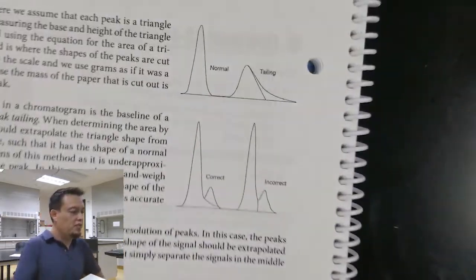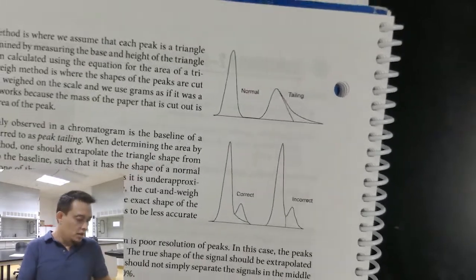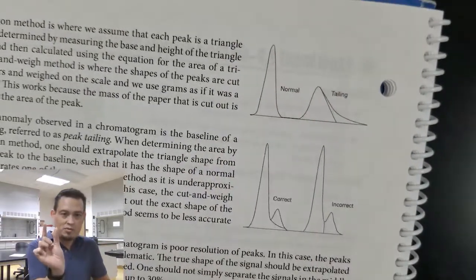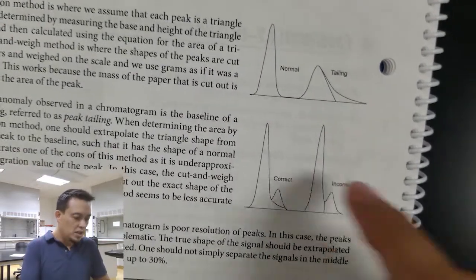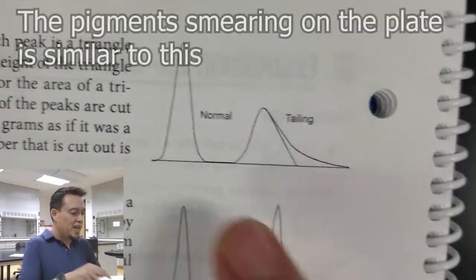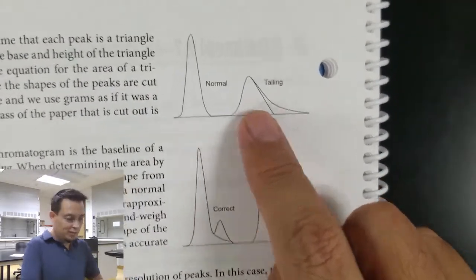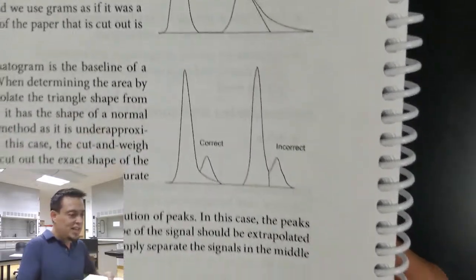Here also in the chart, I show you some examples of bad data versus good data. If you're getting good chromatographic separations, typically your peaks will be normal and narrow. Remember, the narrower these are, the better the separations are. And here I'm showing a tailing effect. Basically what that's showing there is the tail dragging, and it means that your compound is hanging up on the column a little bit longer than it should be for good separations.